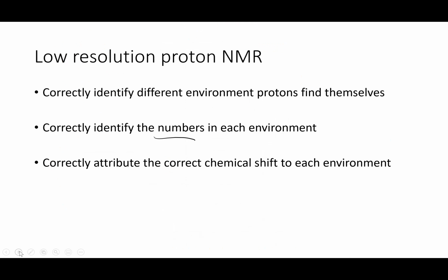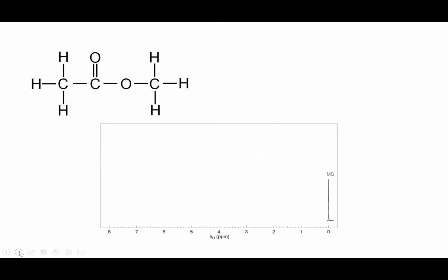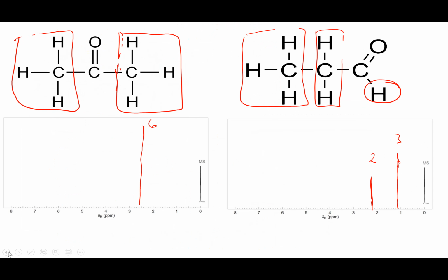So much so that I think in the wee NMR that I've copied to put in here, I'm not even going to be able to put it in. So I'm going to jump away up here, but this would be sitting as a single peak, a way up high there. Okay, we'll make that part of that NMR here.